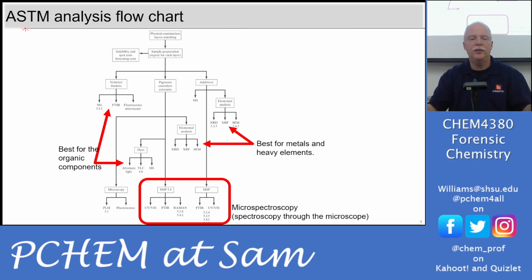And so we can do spectroscopy, not just in the regular instrumental methods like you're used to, go to the UV vis spectrometer, make your dilutions and so on, but we can actually do spectroscopy through microscopes. We can do even infrared spectroscopy through microscopes. Now I have one of those spectrometers upstairs with an infrared microscope hooked to it. So you can look at a sample and then you can flip over to infrared mode and you can get an infrared spectrum through the microscope objective.